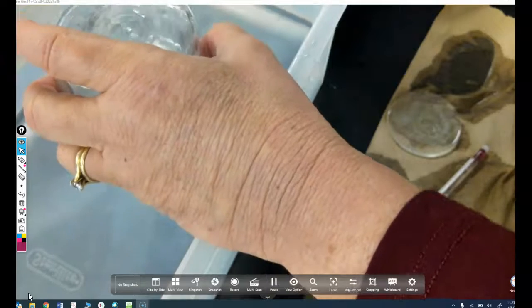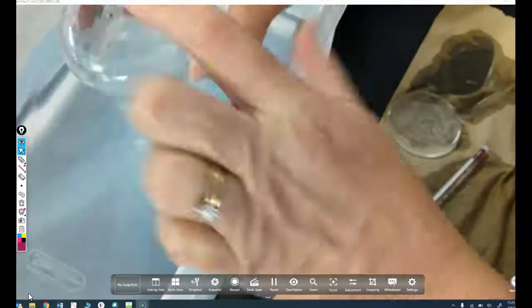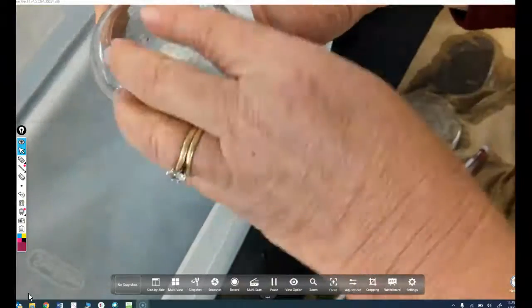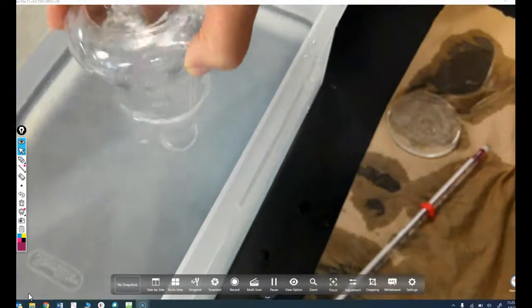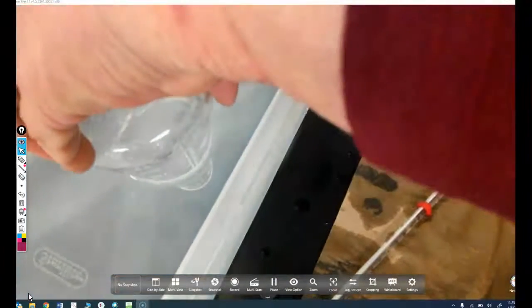And so we are going to be able to be at least a little confident that the pressure on the inside of the flask is the same as the pressure out here outside the flask. And that's why we're raising and lowering it. And then it says place the glass plate back underneath it. So I have it at the right level.